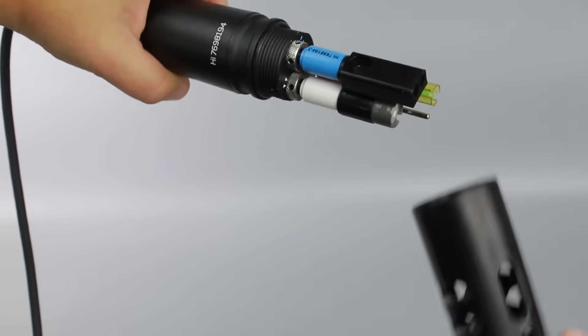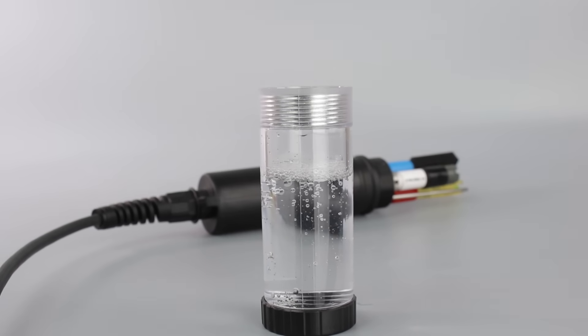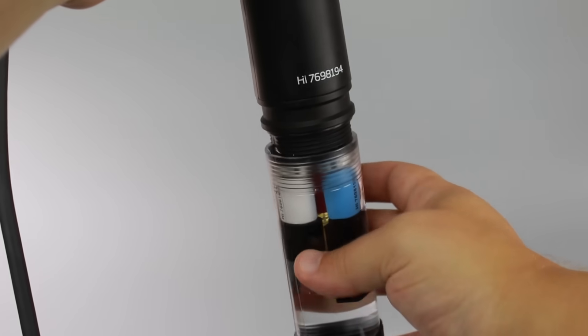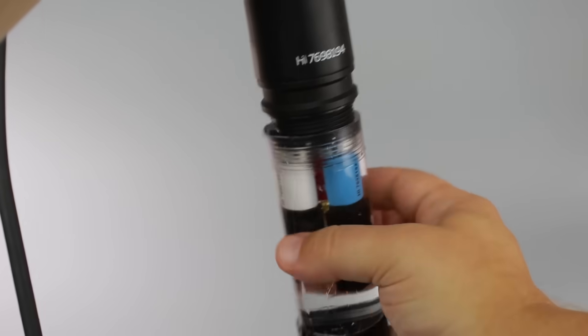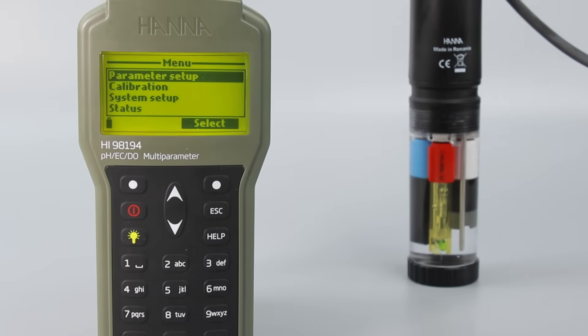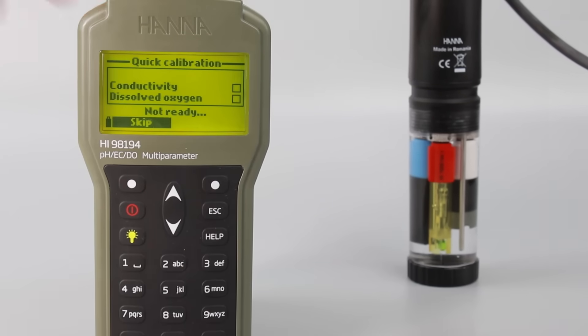To calibrate, remove the protective shield from the probe. Fill the supplied calibration beaker two-thirds of the way with your HI-9828 calibration solution. Submerge the sensors into the beaker and then screw the beaker onto the probe body — don't worry if some solution overflows. From the meter, press Menu and then Calibration. From there, press Quick Calibration and follow the prompts.